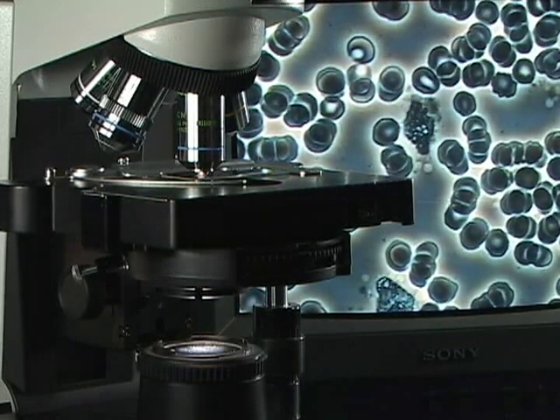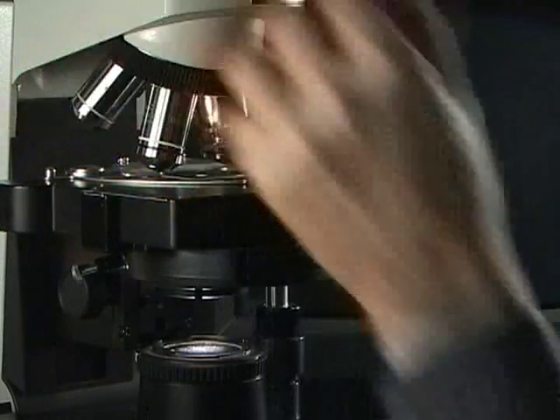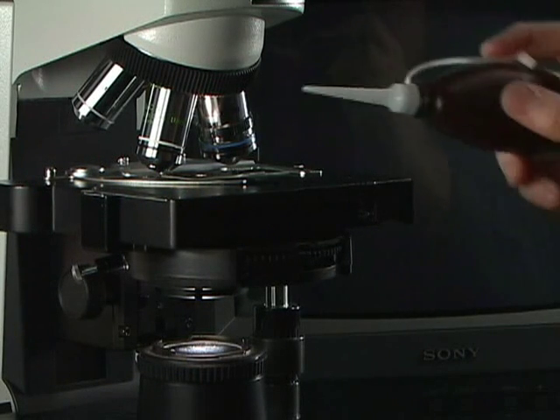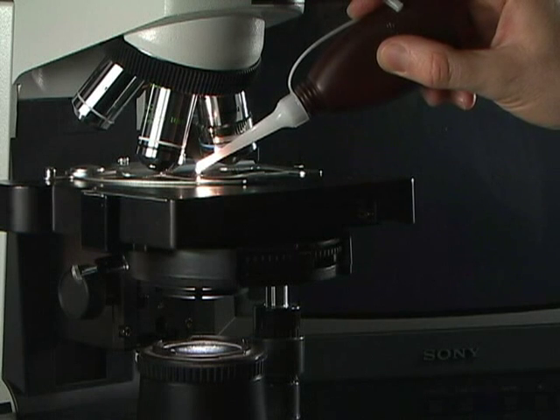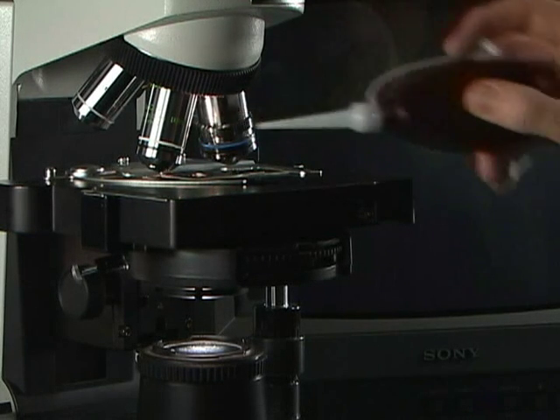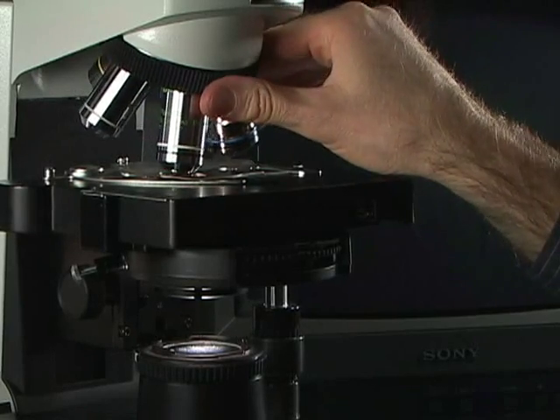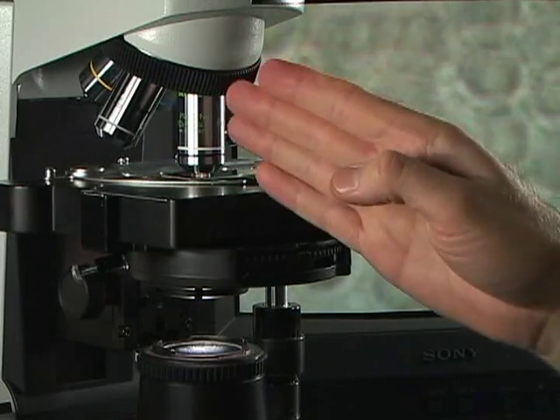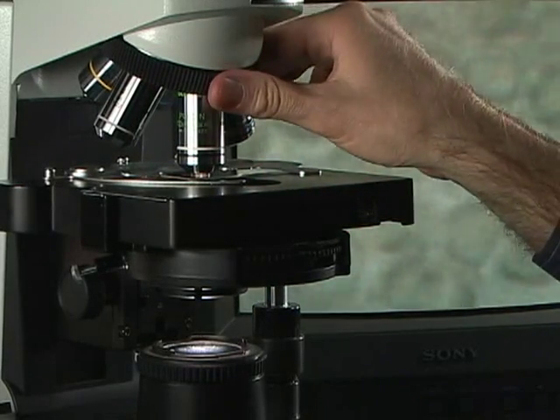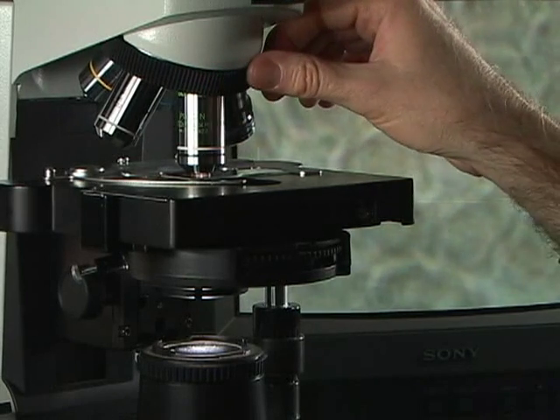For an oil objective, we're going to move our 40x out of place. And we're actually going to put some immersion oil — one drop — right on the cover slip. Then we move our objective into place. This is a 100x oil objective, phase contrast objective. I moved it into the oil and then just slightly back and forth to set the objective in the oil.